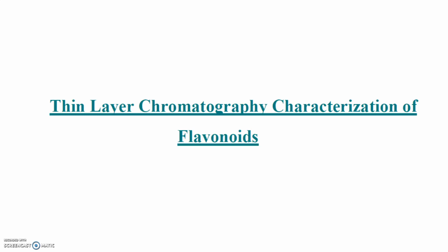Today in this video, we are going to learn about thin layer chromatography for the characterization of flavonoids. You know, my friends, as a chemist, the importance of flavonoids. So, how to extract flavonoids and do the chromatography. We will learn the technique of thin layer chromatography in this video. So let us start from the introduction.